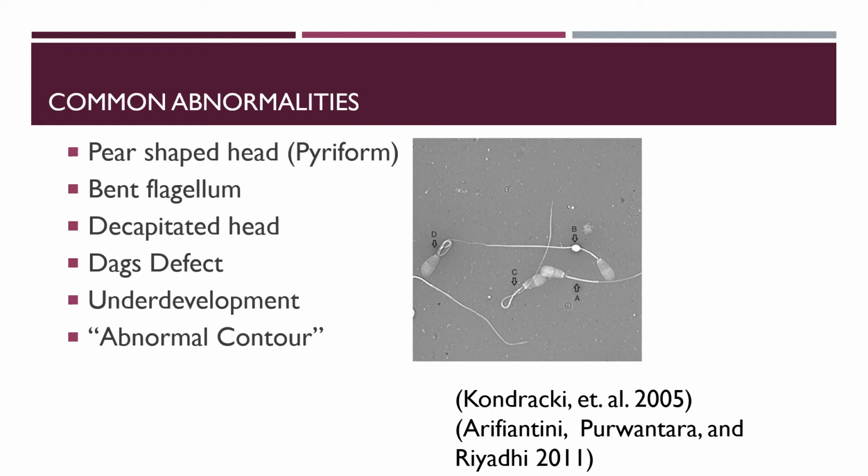Cell C also has the bending and the looping of the flagellum around itself. However, there is that strand of the flagellum that is out in the substrate, so this cell would be able to move. It just wouldn't be able to move as well as a standard sperm cell, and because of the placement of the end of the tail of the cell, it would move backwards as opposed to forwards, just because of how it would propel itself in its position.